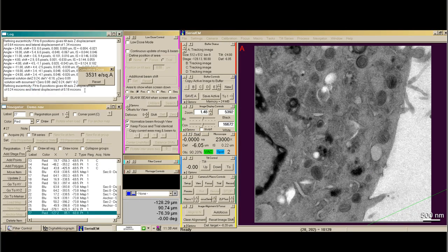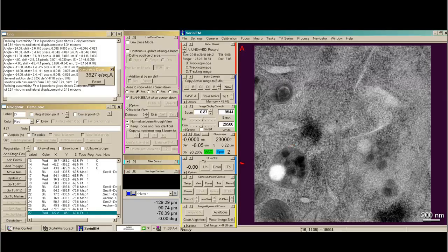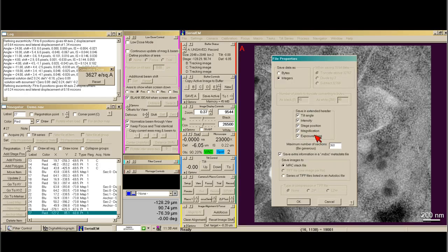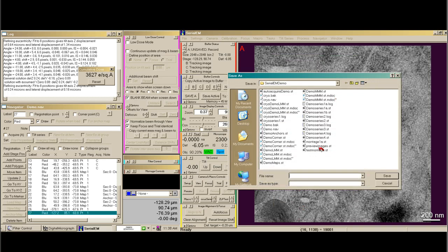This means we'll have very few image shift resets during tilt series acquisition. I'm at the magnification I desire. I'm going to go ahead and take a record image to see what everything looks like. And I'm going to set up my montage. So I go to File, New Montage. I want to make this a vertical stripe, so I'm going to make it a 1x3 montage. Save all of the information in the extended header, and save the file as Montage1a.st.